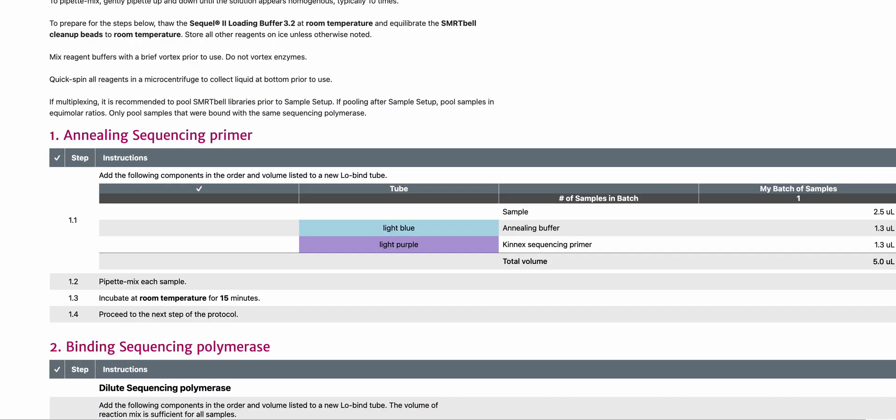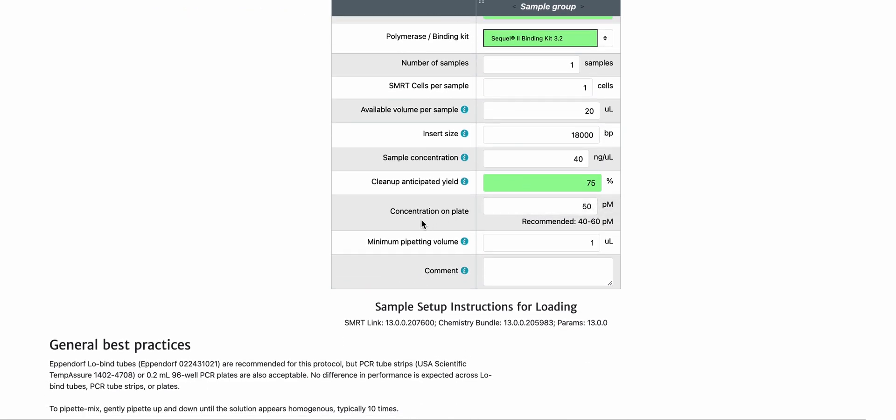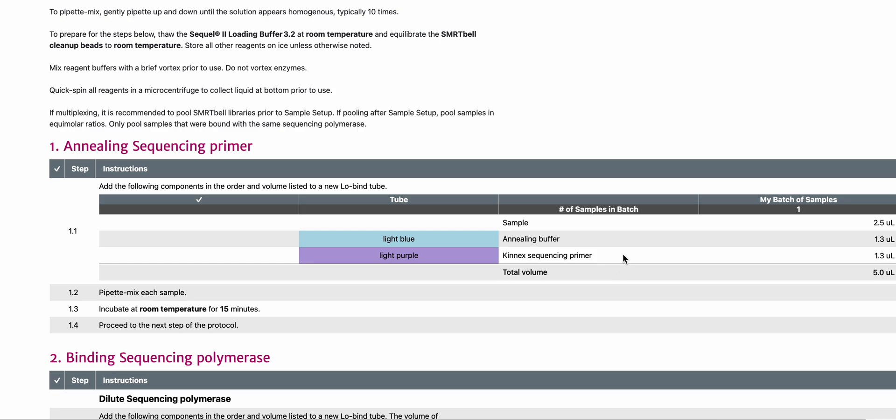Let me show you what this looks like for Kinex 16S RNA in sample setup on SQL2 or 2E. It uses the SQL2 binding kit 3.2, has a different recommended on-plate concentration, and uses the Kinex sequencing primer.